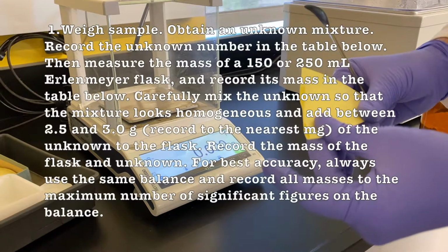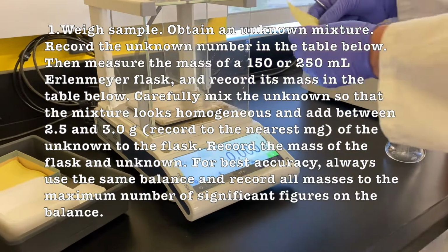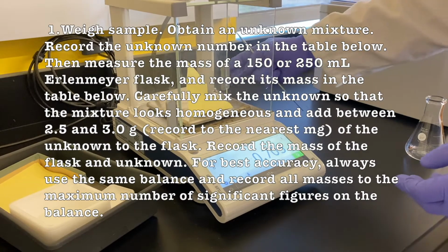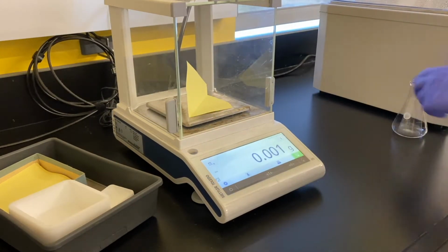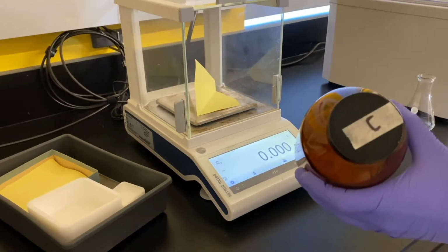And we're using mixture C. So we're going to be using various chemical and physical separation techniques to identify the percentages of all of these. We're going to start off by just weighing our sample, getting a set amount of our unknown. Again, that's unknown C. Make sure you make note of that.